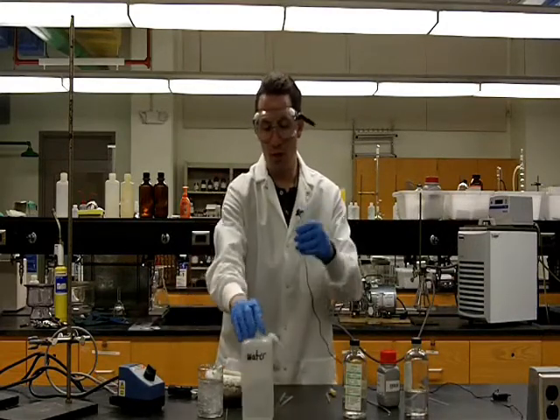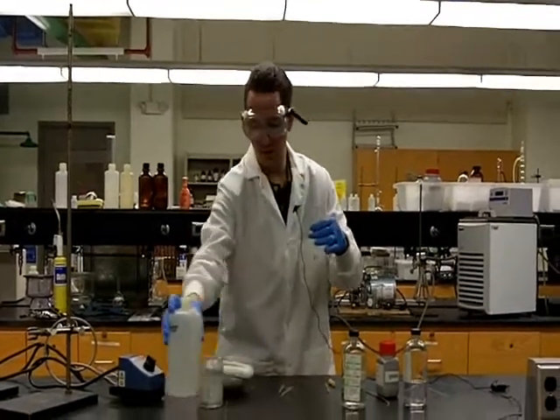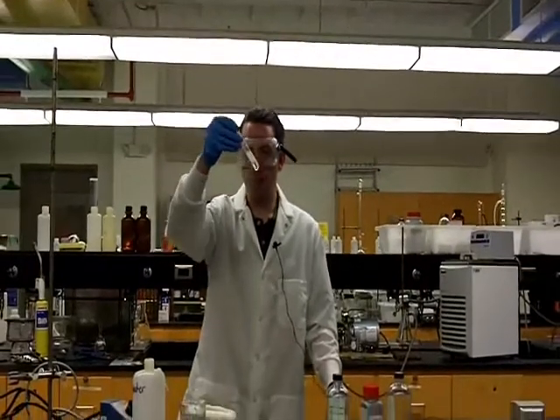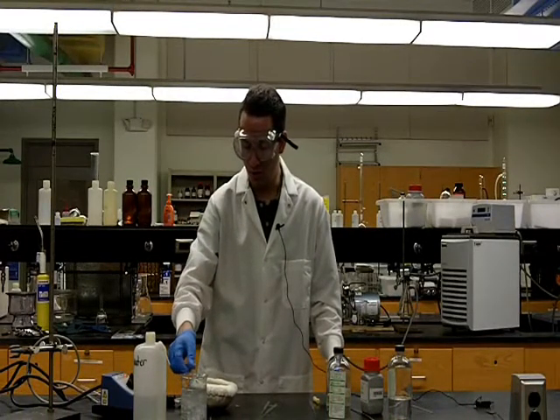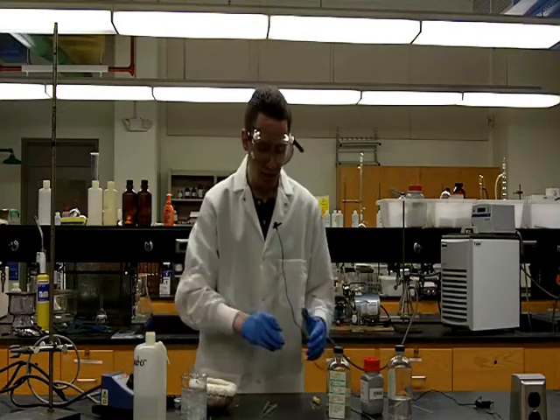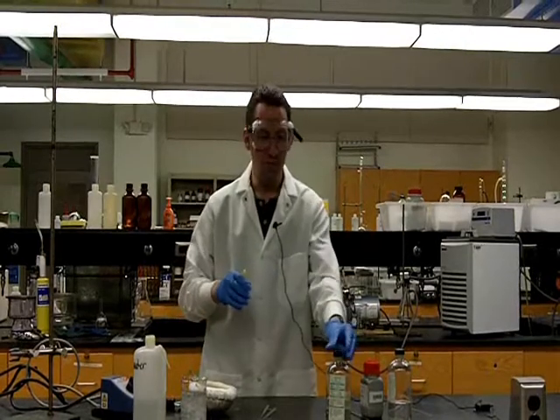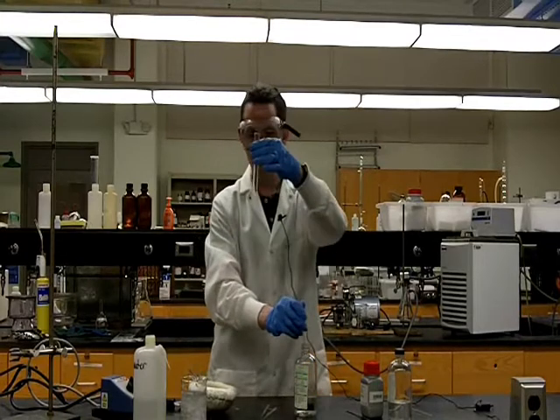So from here, we're going to switch to a more polar solvent, in this case a very polar solvent being water. And now as I shake this test tube, we can see that the fluorene is not dissolving at all. So far this is one possible solvent for this recrystallization, because that's what we want, is we want very little solubility at room temperature. Now the second part is when the water is boiling, we do want it to be highly soluble. So I'm going to put that in my sand bath, which I've preheated, and see if when it comes to a boil, if it has dissolved or not.